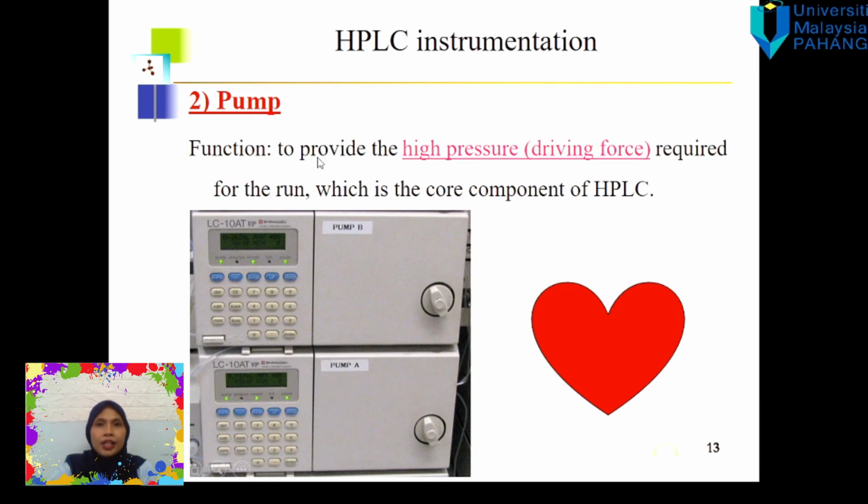And the heart of the HPLC, the second compartment, is the pump. The pump functions to provide the high pressure or driving force for the run, and it is the core component of HPLC. This pump will pump all the solvent through the column.